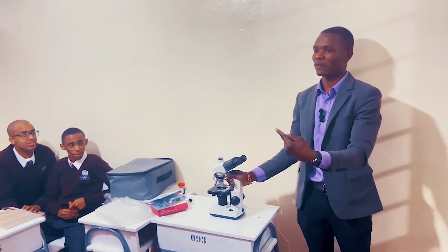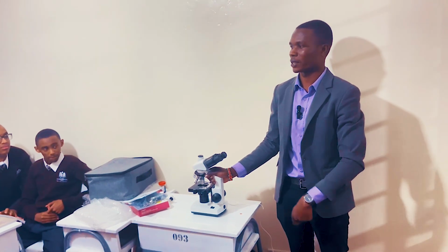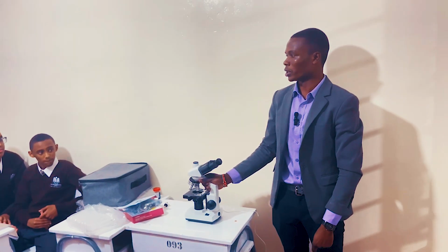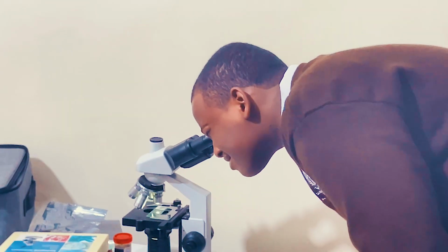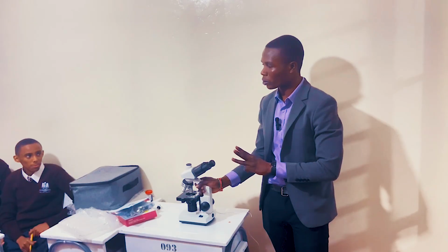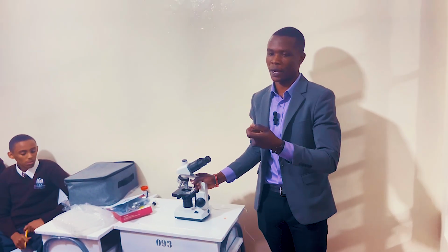And we said light microscope uses light to magnify objects, okay? Electron microscope uses electrons to magnify objects. Is that okay up to that point? Good. So today we have a light microscope here, and we want to see the procedure of using a light microscope and how to prepare specimen to be viewed under light microscope.